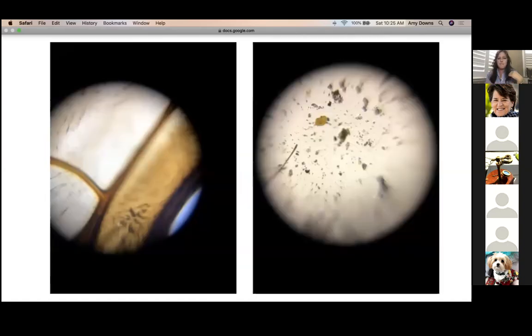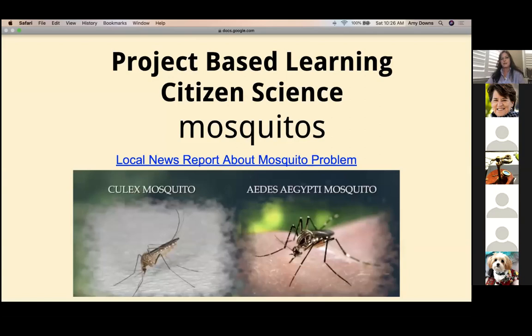This is part of his wing. And then this is part of his wing. And then that's the one that had like a little hair and probably a little piece of pollen and other little black specks. So when I start to Foldscope, I'm like, I'm not sure what I'm looking at. So I just took these pictures yesterday, and I would definitely reach out to either the Foldscope community or someone who could help me explain more from what I'm seeing, because you start with one thing and it just dominoes, question after question after question when you start Foldscoping, which is great for kids.